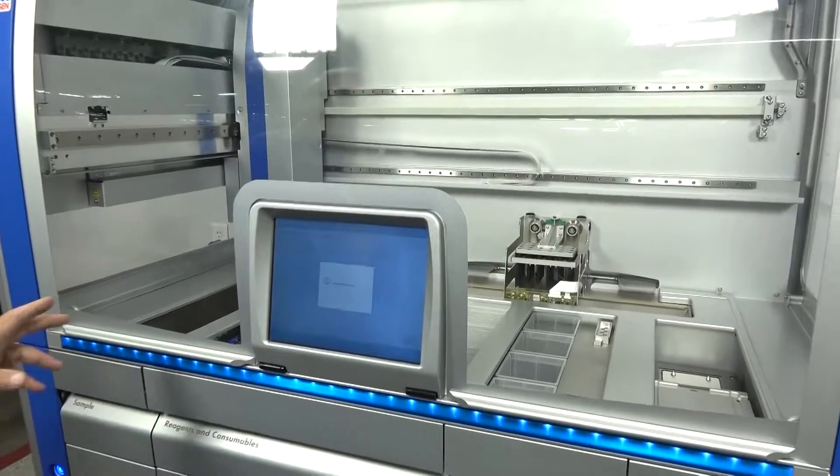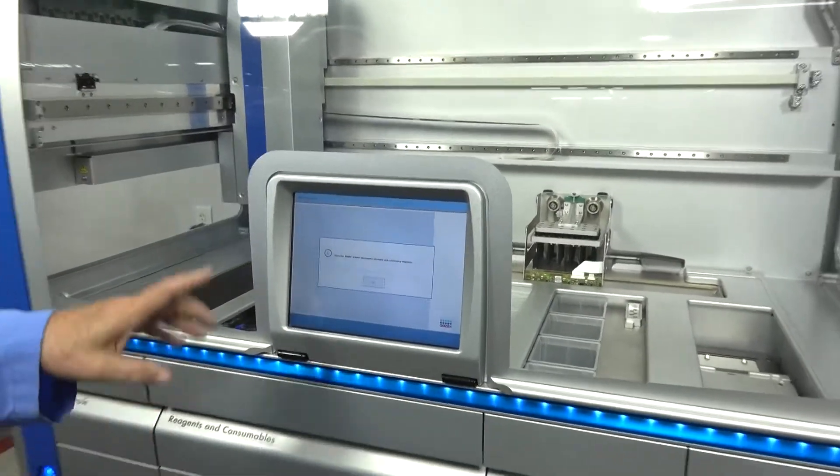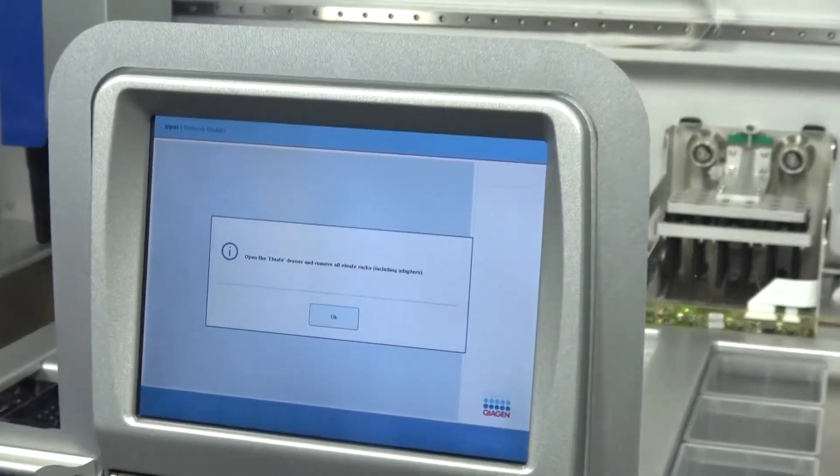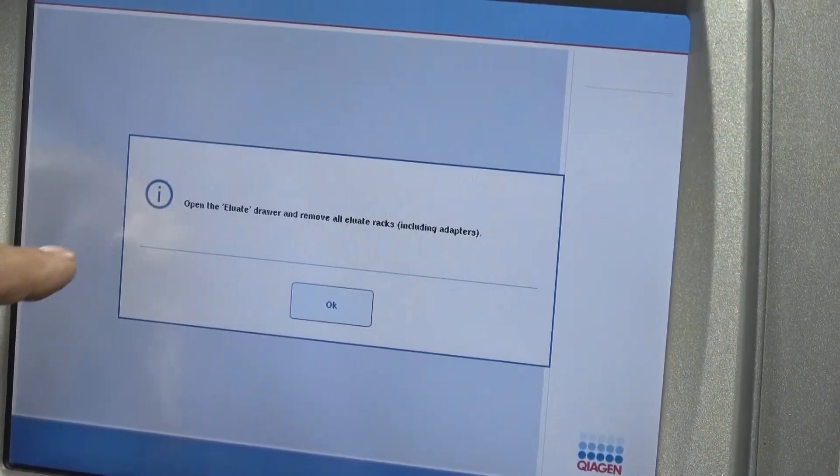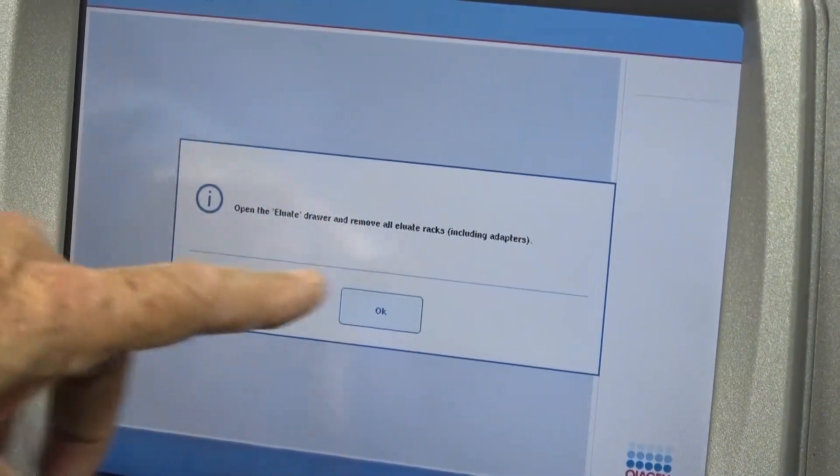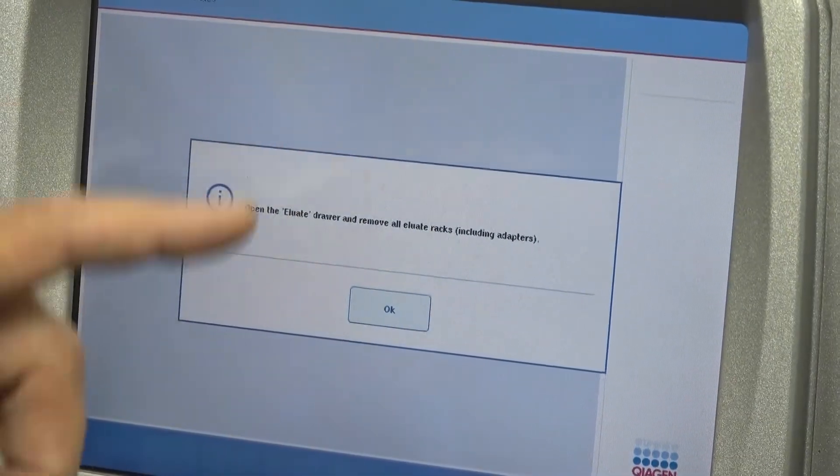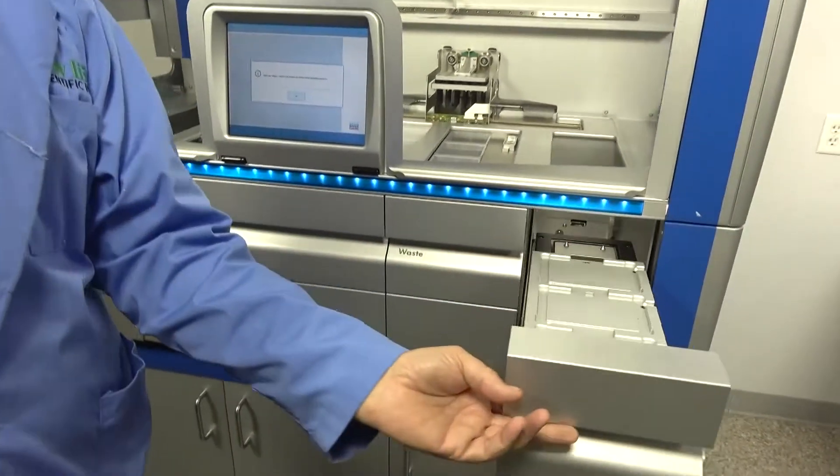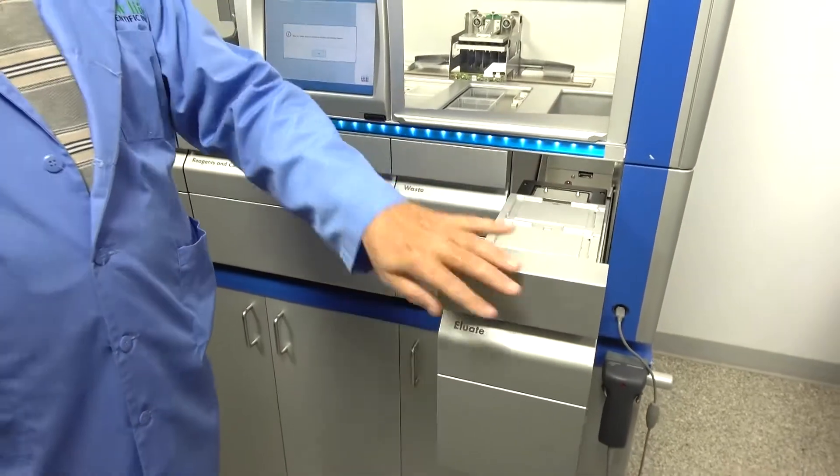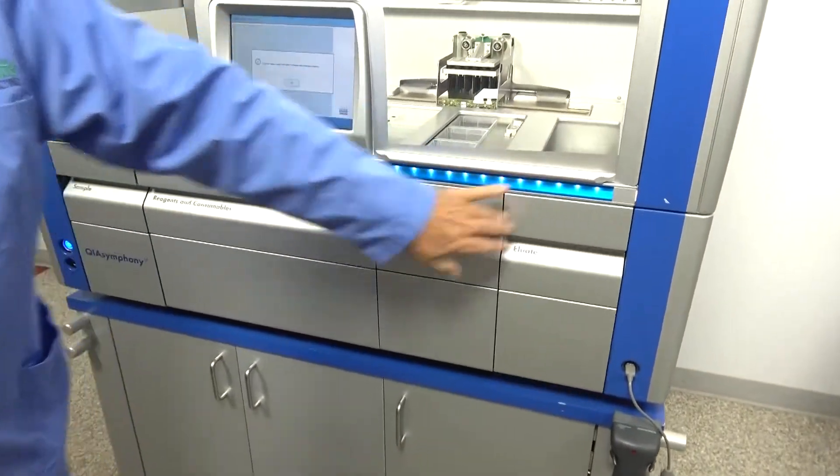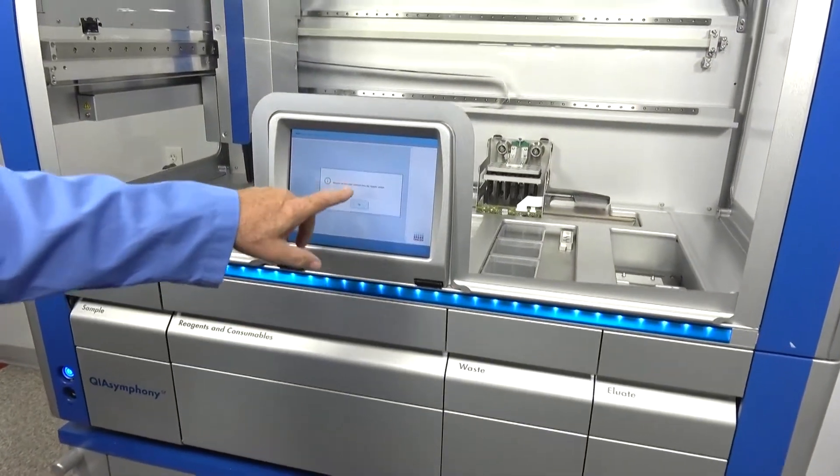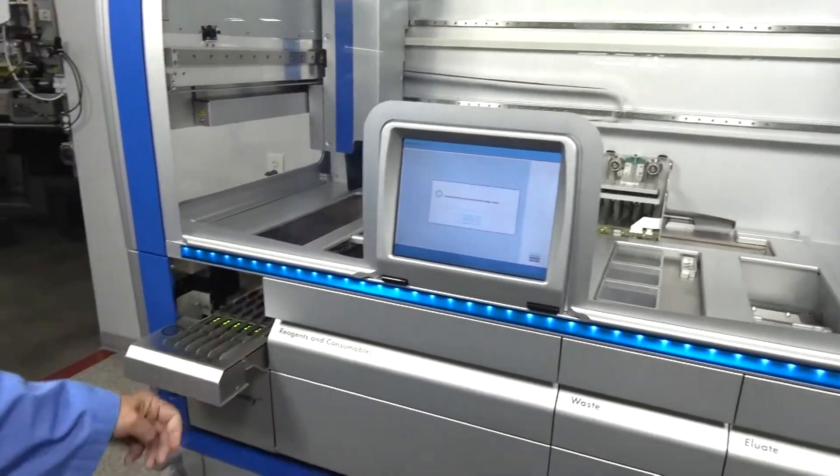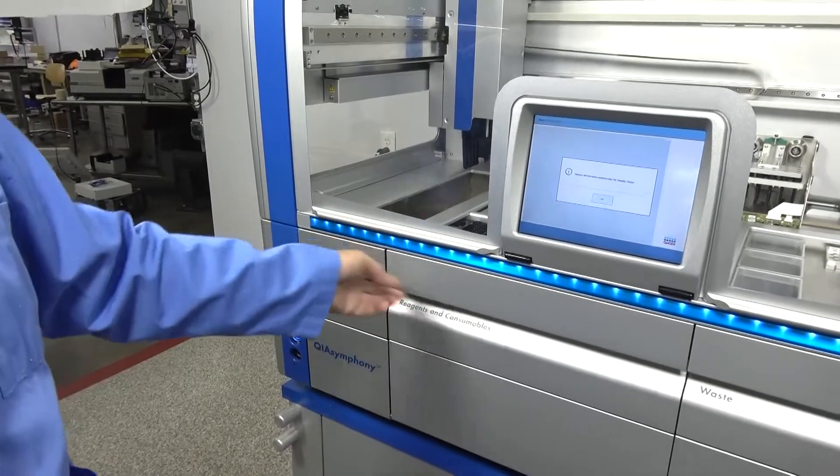Again, touchscreen makes it easy to use. It makes sure everything is locked. I can't pull things open right now. Actually, I can because it's telling me to. It says open the drawer, remove any aliquots that I would have in there. And as I said, it walks you right through. Remove any tube carriers.